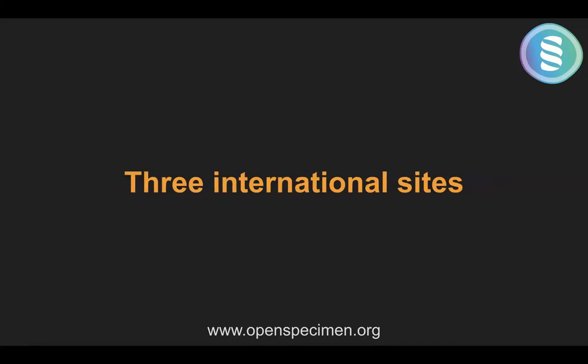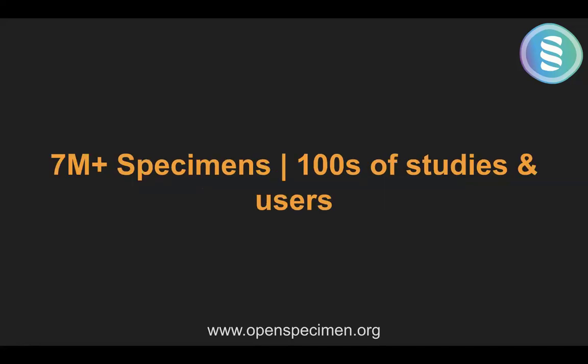It was a multi-site biobank with three repositories: one in IU Indianapolis, one in Tel Aviv in Israel, and one in Italy. All of them collect specimens for the same kind of clinical trials that were run across multiple sites and local repositories. All of them now centrally log into OpenSpecimen to manage their specimens.